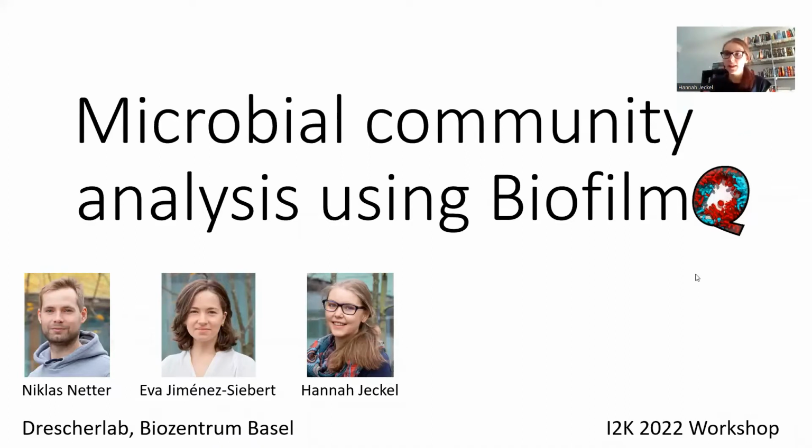My name is Hannah. I am a PhD student in the lab of Knut Drescher, and I will be giving this workshop today, which I made for the I2K, the Images to Knowledge conference in 2022. However, this will be available long after, hopefully, so that I hope that even people who weren't able to join the I2K will be able to benefit from this workshop, which focuses on BiofilmQ.